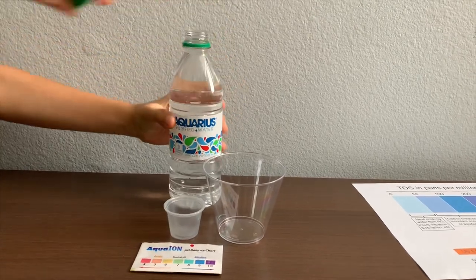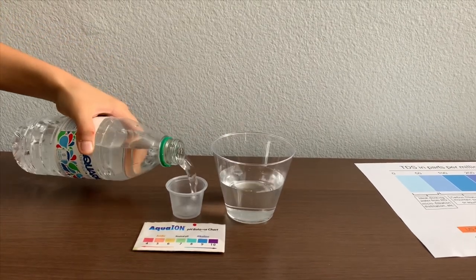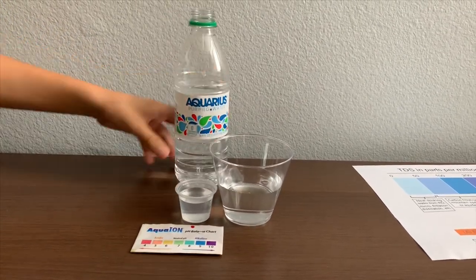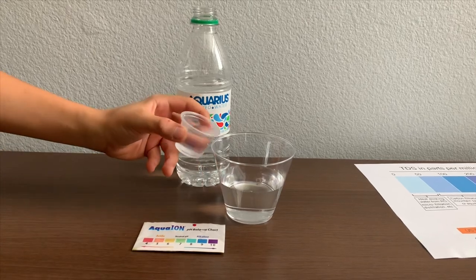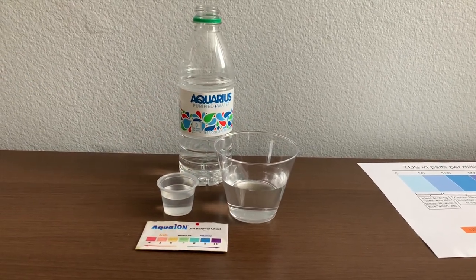Let's pour some water in. This is a little too much for the pH cup. Let's pour some back in the TDS. First, let's test the TDS level.